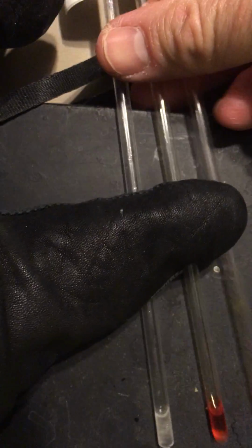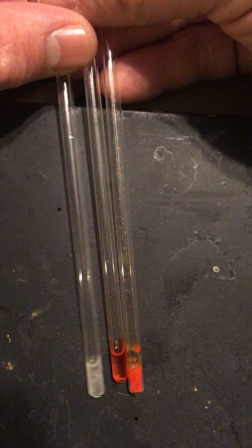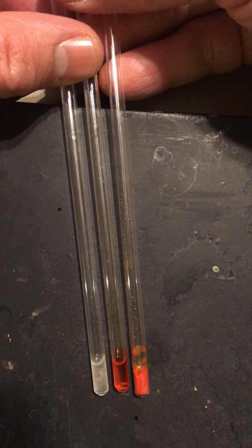I have sample tubes in a gloved hand here to bring the samples themselves up to near body temperature. What I have here is a sample of eicosane on the left. It's a solid, and I have a sample of azobenzene on the right, which is also a solid.